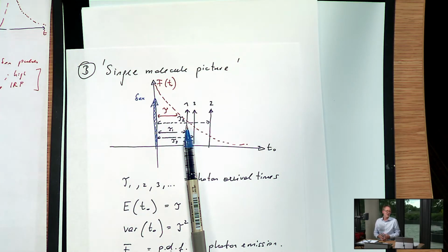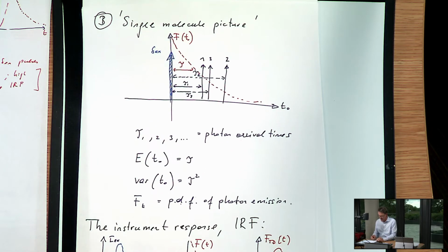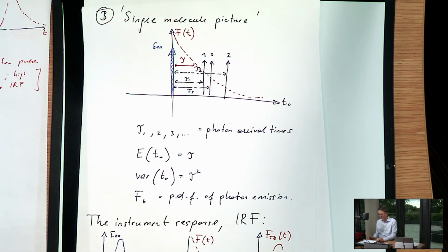And maybe you need 10 to the minus 12, 10 to the minus 10 seconds resolution. You need very small resolution. If you have any jitter in the electronics to measure these short speeds, then of course there's an error there, and that will be convolved into this instrument response function just the same way. And you need to know that to get the most accurate data out.